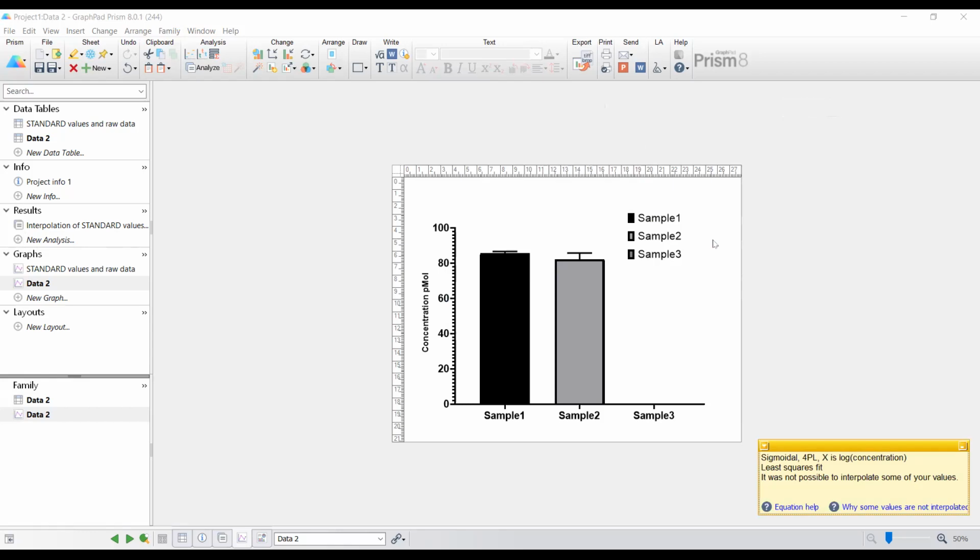I still have some values which were unable to be determined, but I still have some. And then I just copied the mean values for the graph, or even the values I got from the measurement. And then I made a figure which looks like this.